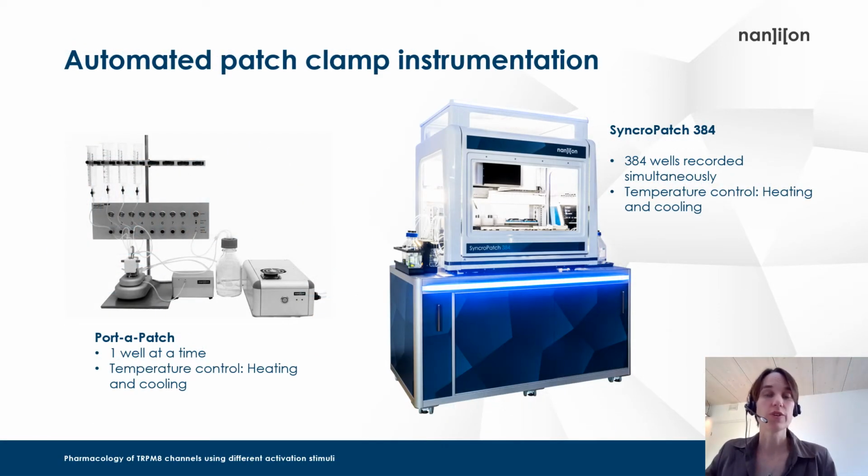In this study, we used two automated patch clamp devices, the PortaPatch and the SynchroPatch 384. The PortaPatch is a semi-automated planar patch clamp system for recording from a single cell at a time. The SynchroPatch 384 is a fully automated robotic system for recording from up to 384 wells at a time. In both systems, a planar glass chip is used and suction is applied from underneath to attract a cell to the hole, to get a good seal and to get into the whole-cell configuration. Both systems are equipped with temperature control that can heat as well as cool.